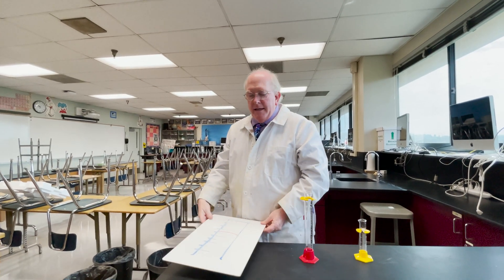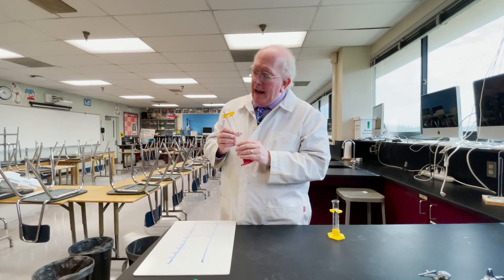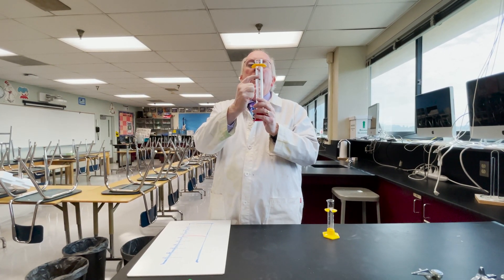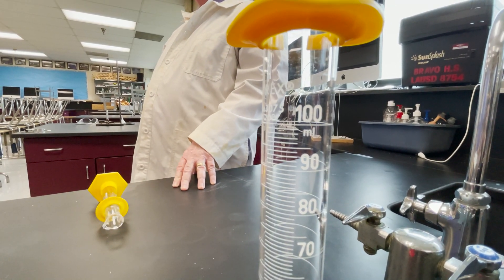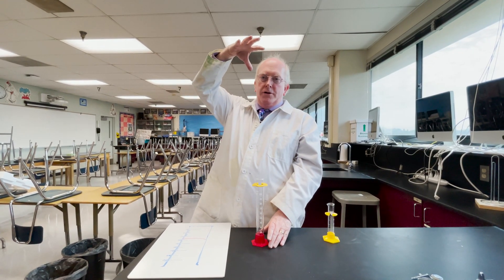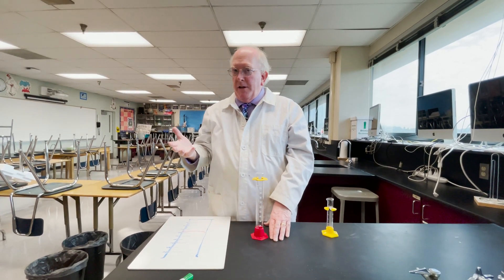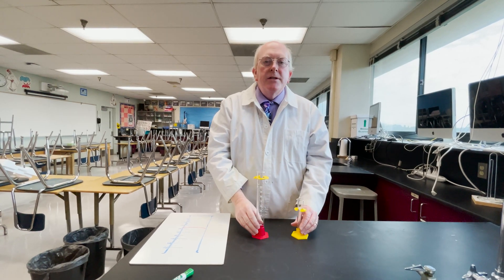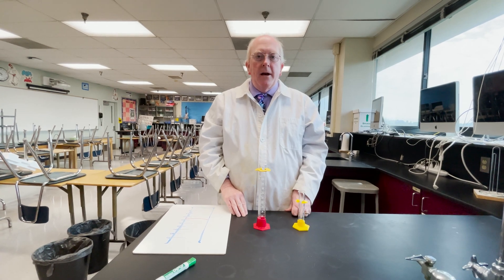The unit for these is typically milliliters, the same thing as a cubic centimeter. When I look at this graduated cylinder, it says ML, indicating we are measuring in milliliters. For very large graduated cylinders it might be a different unit, but that's not likely. So that is your basic use of a graduated cylinder. Thanks for tuning in — this is Morgan, signing off.